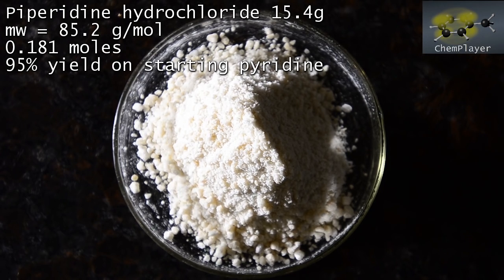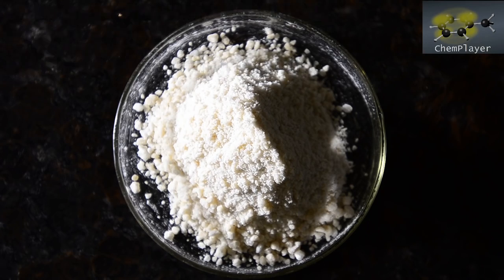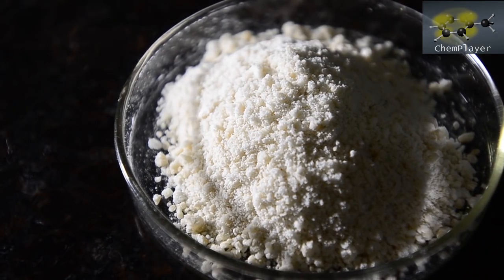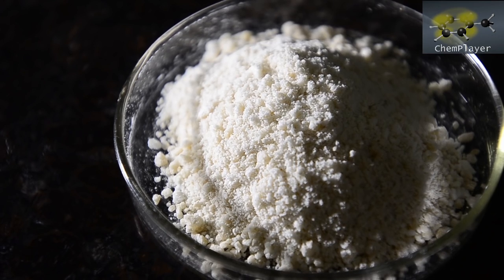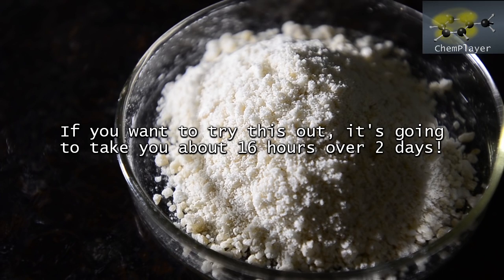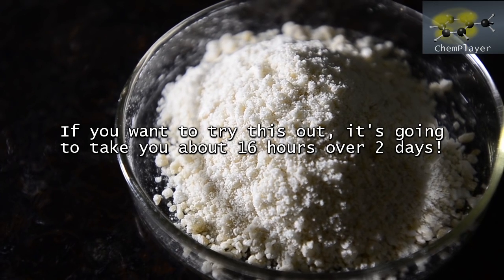But we're pretty happy that we didn't blow our leg up in the process, and despite the amount of expensive ethanol and sodium metal consumed, it's a good achievement. Do know that if you want to do it yourself, it's 2 whole days of work.